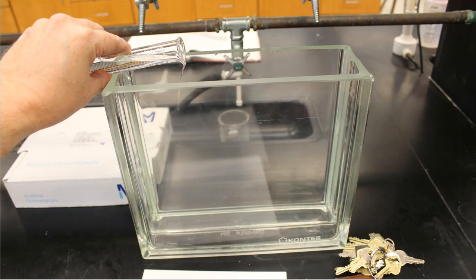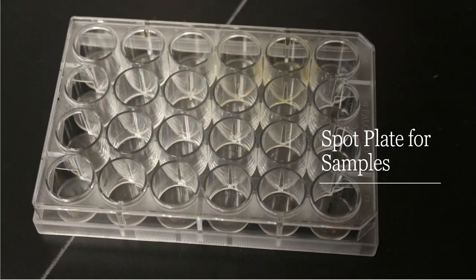And now the next part of my lab directions is going to tell me to make solutions of the knowns. And I'm going to use ethyl acetate as the solvent for those. So the easiest way for me to do this is I just went to get a spot plate, all right? The spot plate will give me different wells that I can put individual components into. And for 2 milliliters of ethyl acetate, these wells are big enough to hold that without a problem. So that's exactly what I did.